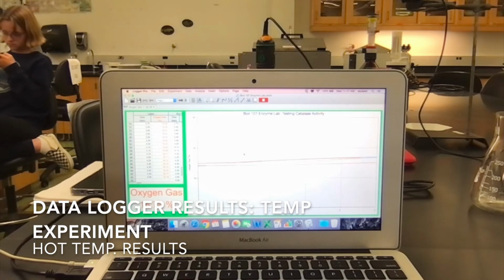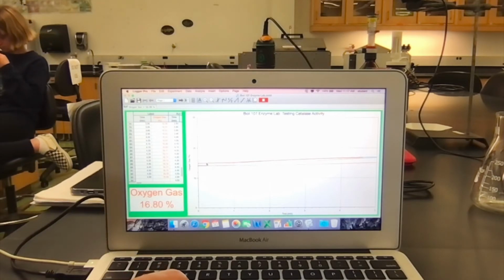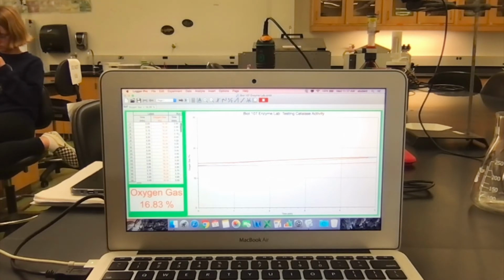Okay, this is the last run. You can see this orange line is the hot sample, and it kind of went up. It's hovering around 16.8, I would say. Started at high 14 and went up to about 16.